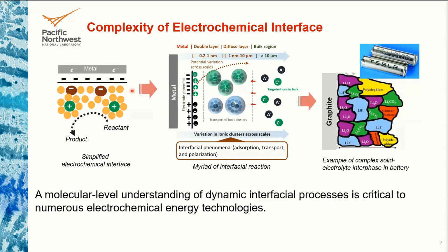Addressing this knowledge gap is also very relevant to the mission of the US Department of Energy, Basic Energy Sciences, and also my group at PNNL. So the main objective of our group at PNNL is to achieve a mechanistic understanding of this ionic or charge transfer dynamics that takes place at the operating interfaces using advanced electrode preparation techniques like ion soft landing, and employ nano-electrochemical techniques to characterize the interfaces to elucidate the surface chemistry during the reaction. Today, I will be focusing more on different modalities of nano-electrochemical characterization techniques, and I will leave out details about the ion soft landing. But in case you want to know about those techniques, you can find them online on my group page.